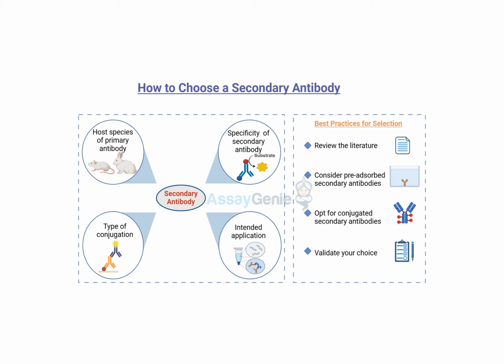So if you're using a fluorescence microscope, you need an antibody that's conjugated to one of those fluorescent dyes. Exactly. And if you're using a method based on color change, you need an enzyme conjugate. Exactly right. You've got to match the tool to the task. And each one has its own pros and cons. Oh, I bet. It's going to impact the sensitivity, the signal stability, and how well it works under certain experimental conditions. So there's a lot to think about even within that one choice of conjugation.